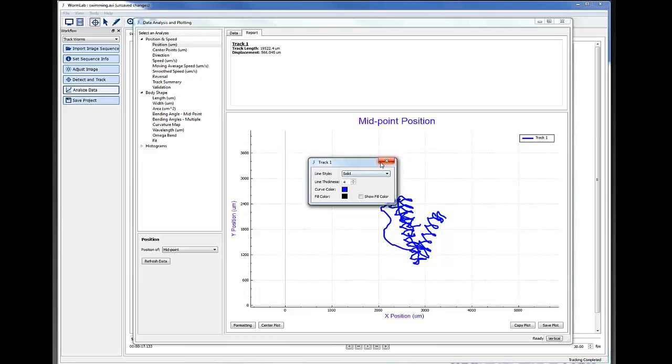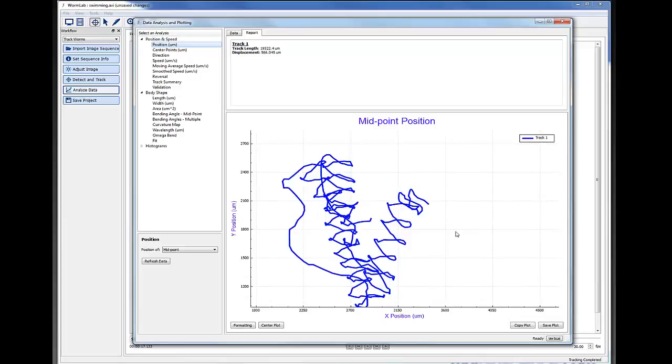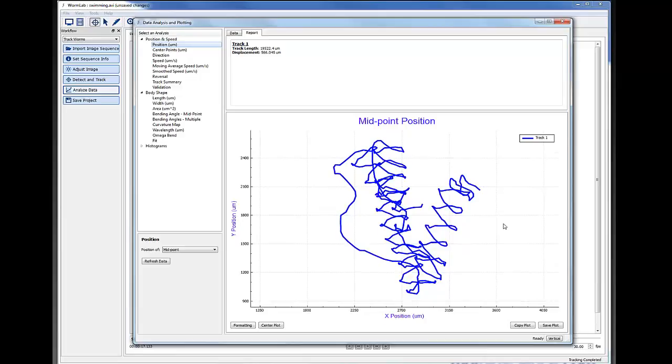If you look at this, you'll notice you can't use this data. You can use it for the bending angle analysis, but if you try to use this data to get the total track length, you have a problem because the researcher has been moving the worm plate. You'll see that's what this long line is. While the video was moving, they would continue to move the worm plate. What we're trying to show you here is that even though that plate is moving, we're still capturing the body shape and the bending of the worm. So you can do this and move the worm as you go.